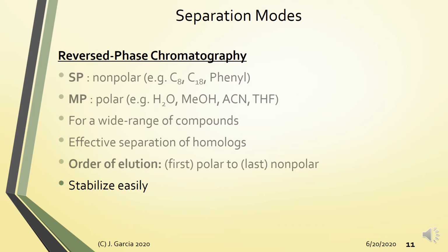For example, if you're going to use a mixture of methanol and a buffer as your mobile phase, and your storage solvent is methanol, you cannot directly pump in the mobile phase, because this will cause salting out of the buffer inside the column, which will clog up the column. So you need to gradually condition the column to the conditions of the mobile phase.